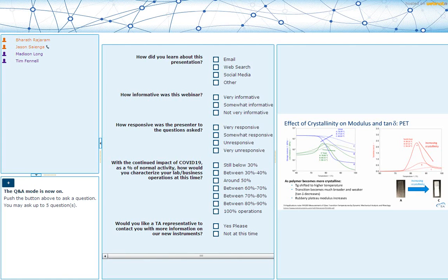If you start to have a composite of different materials, there are some cases where TTS holds. Usually it works when the temperature sensitivities of both materials are very similar, or they have very close activation energies. So examples of miscible blends where TTS can be applied would be PPO and polystyrene, PMMA and PVDF. Immiscible blends where TTS works: ABS, polycarbonate and polystyrene-polycarbonate mixtures, polyethylene and polypropylene. So those types of materials, it tends to work. It fails in a lot of other cases too.